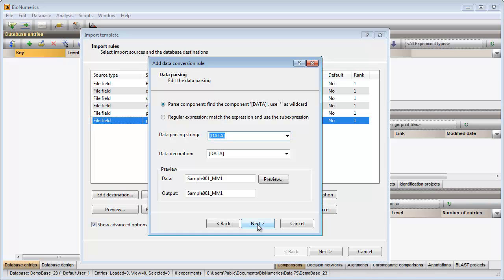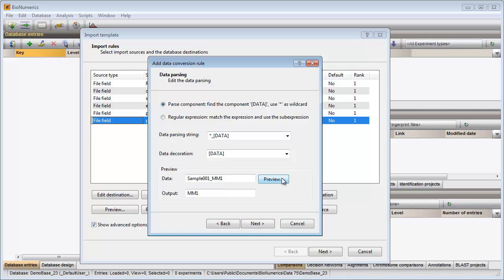In the last step, I need to specify a parsing string. With this parsing string, the text appearing before the first underscore is omitted. The correct part is kept as pool information.